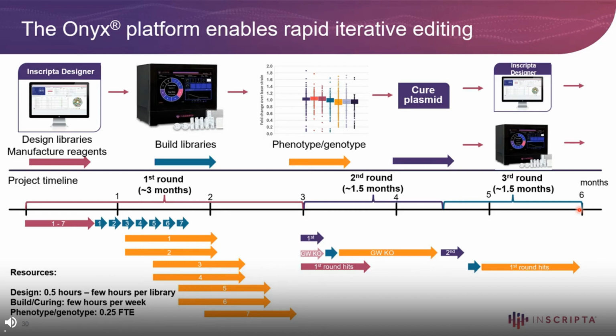Well, what about effort? So FTE time. So that's actually quite minimal. So designing these libraries takes anywhere from a half an hour for very simple libraries to a few hours for some of the more complicated libraries. So not a huge amount of investment in order to design these libraries. So building the libraries or curing the libraries, this is really minimal effort. It's really a few hours per week in order to put the reagents on the instrument, press go, or go through the curing procedure.